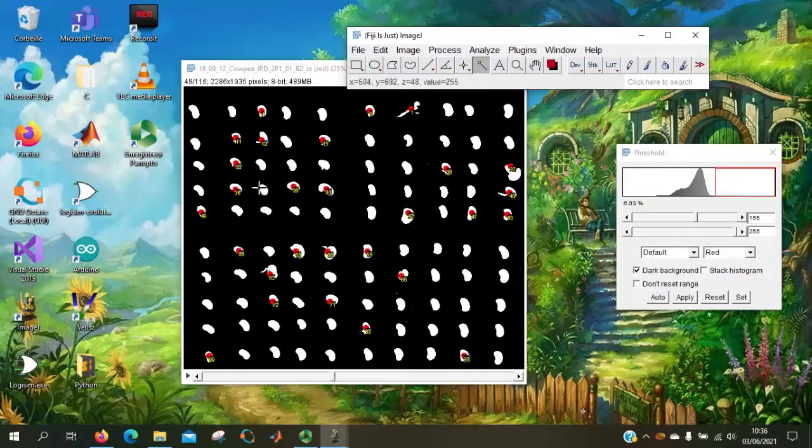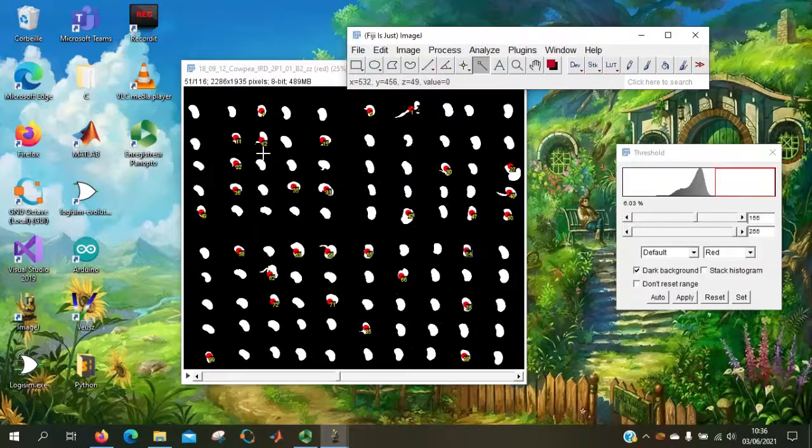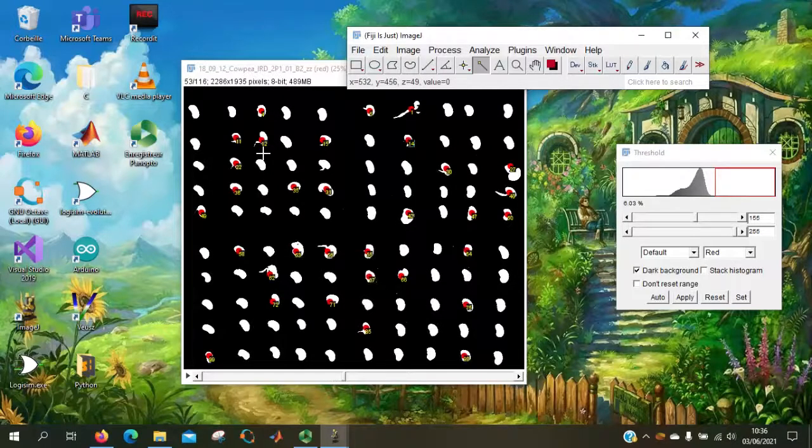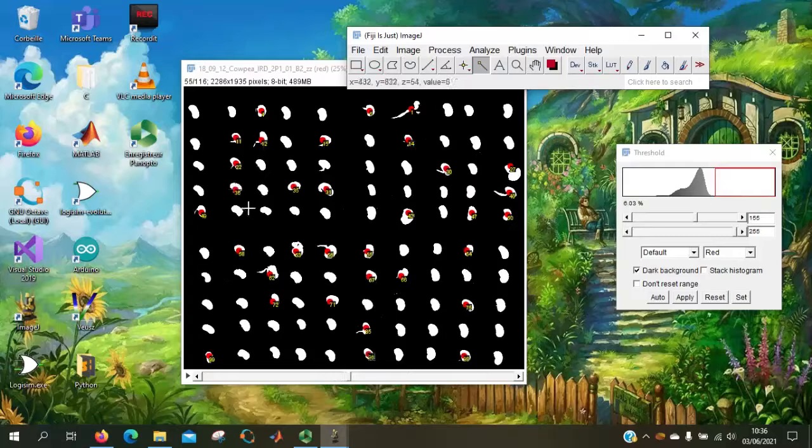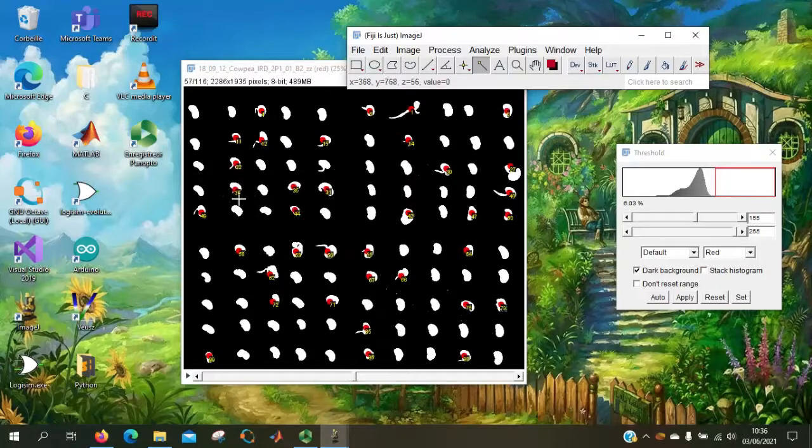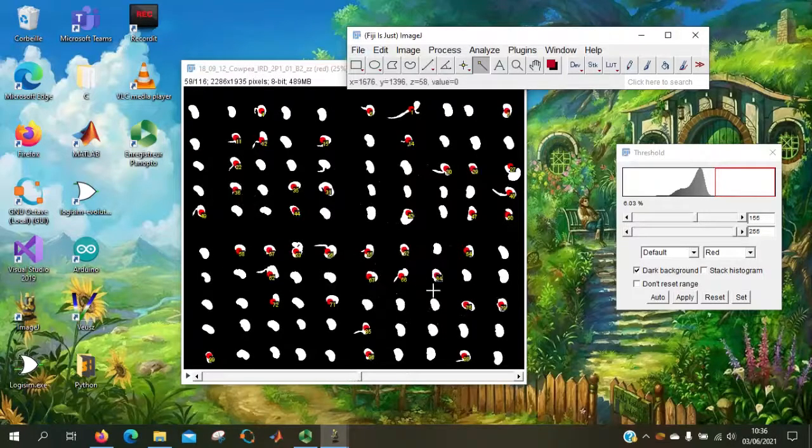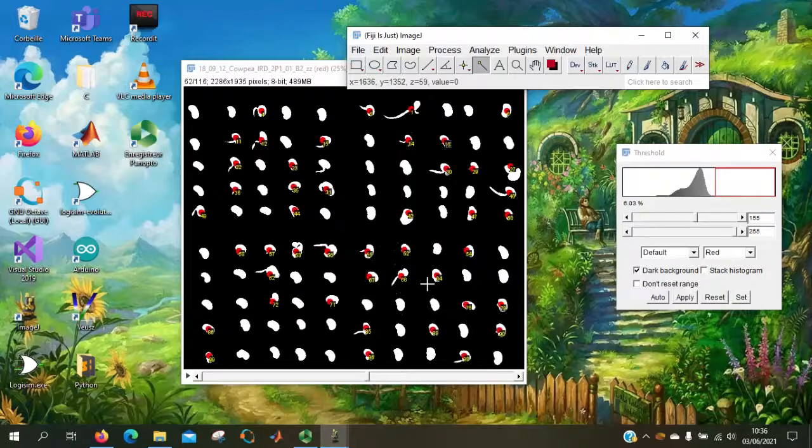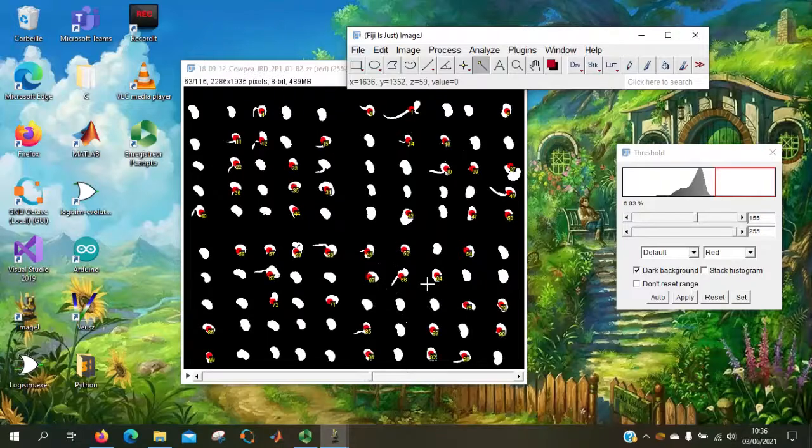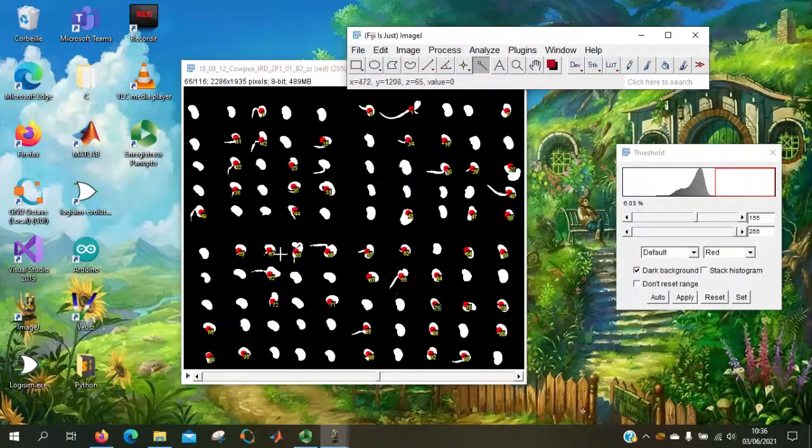Here it shows the germinated seeds. So we can see a dot, a red dot on the seed, which have already germinated. And the label here.